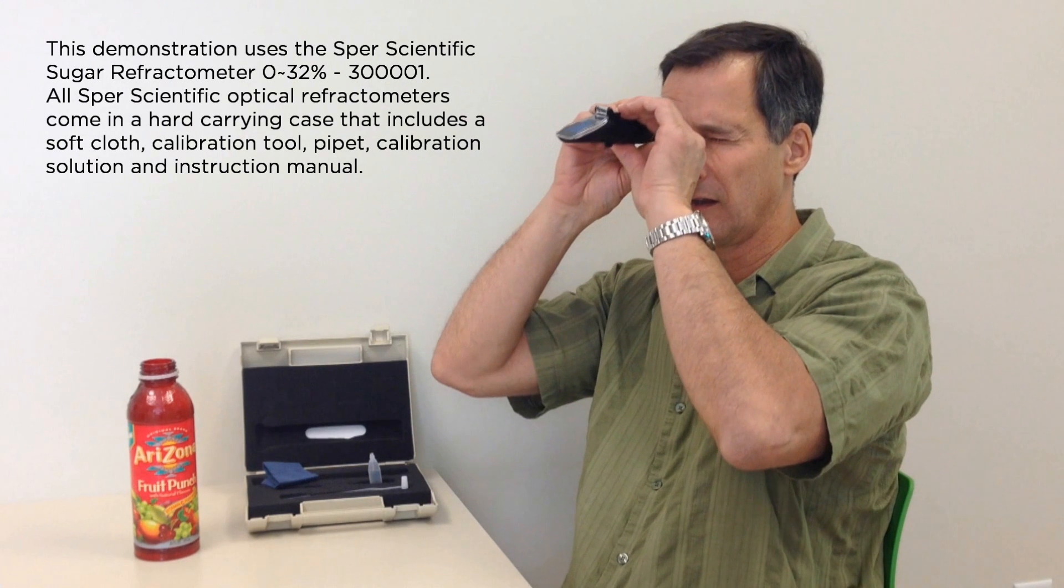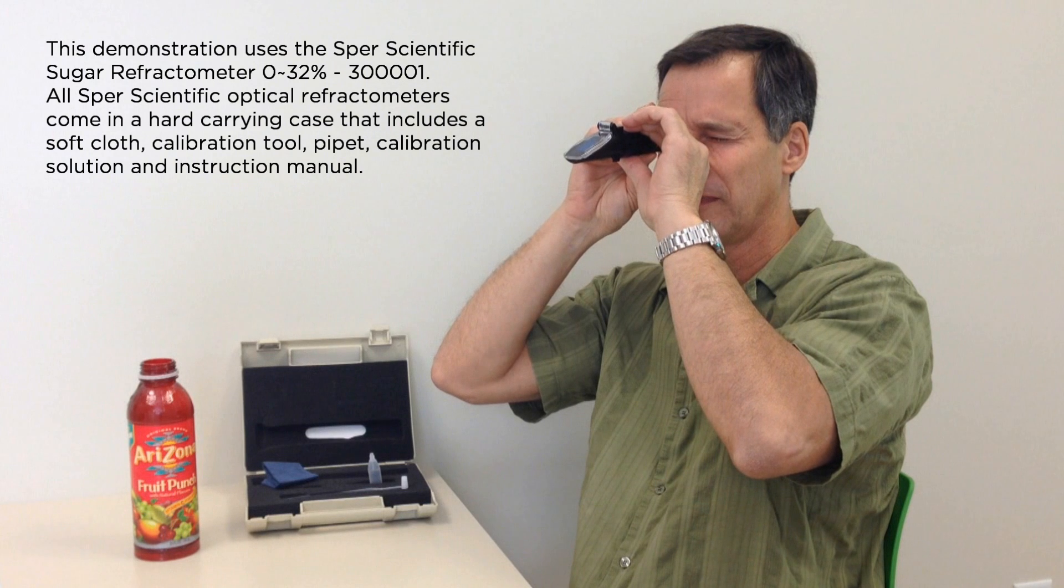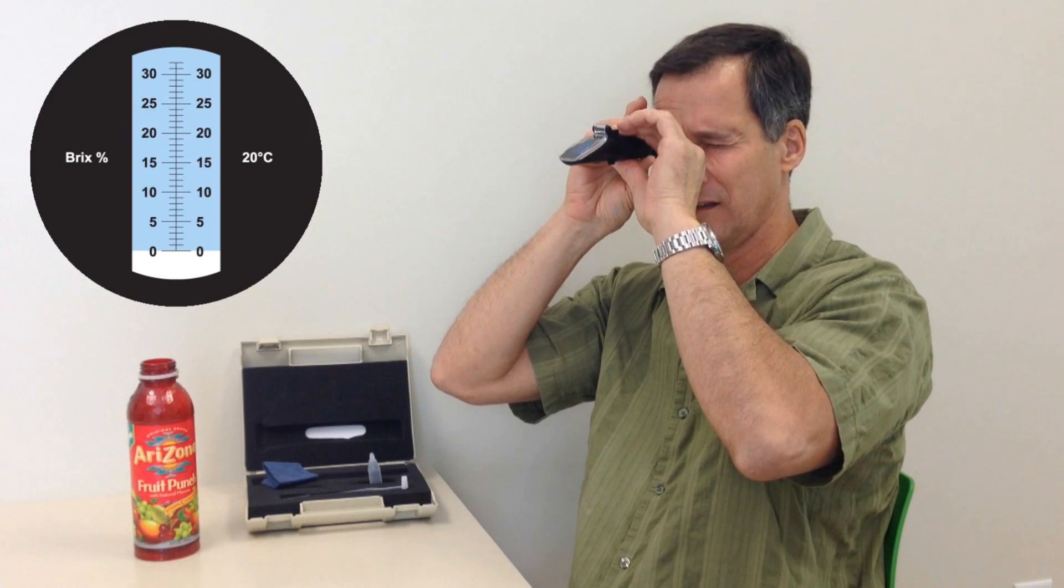Next, I look at a light source. There's enough light in this room for me to see clearly, and I simply focus until I see the scale clearly.